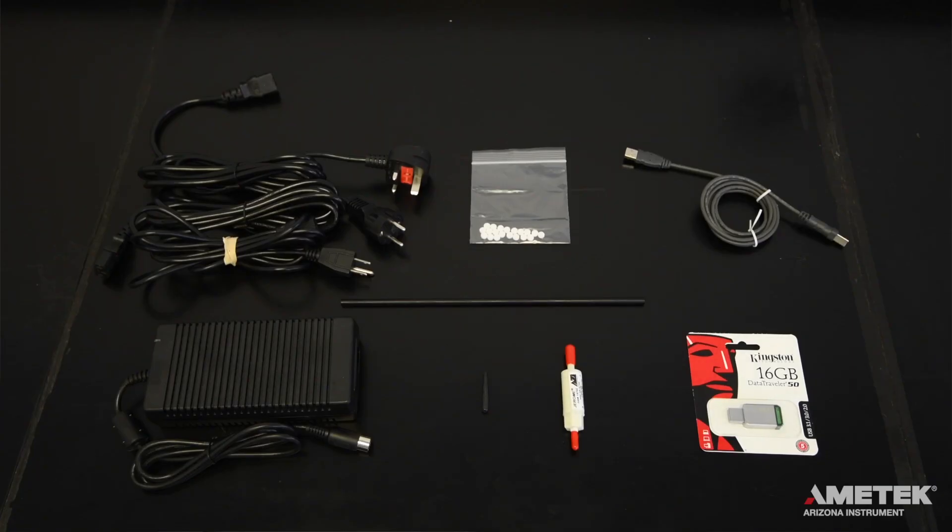If you have purchased the J405 with the communications package, you will also receive a six-foot type A to B USB cable as well as a USB flash drive. If you are missing any of these items or have questions about these or any other parts and accessories you may have received, please contact Amatec Arizona Instrument or your local representative for assistance.